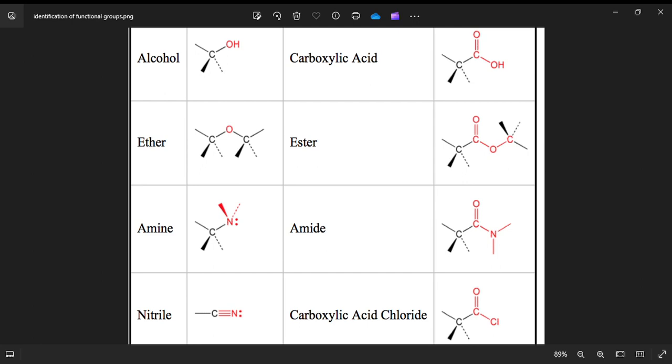And now we have tried to differentiate between phenol and carboxylic acid. With phenol, there will be no effervescence when sodium hydrogen carbonate is added to your sample. But with carboxylic acid, there will be effervescence. Two, a colored solution is always formed with iron chloride when phenol is there. But with carboxylic acid, there's nothing like a colored solution, but a sweet, fruity smell of an ester. So it will do you good if you also go over and listen repeatedly to the audio revision before your exam. God bless you.